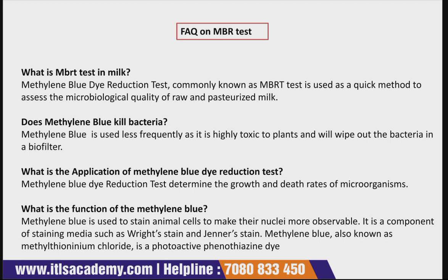Now the second question is, does methylene blue kill bacteria? Meaning, does methylene blue have the capacity to kill bacteria? Methylene blue is used less frequently as it is highly toxic to plants and will wipe out bacteria in a biofilter. Now the third question is, what is the application of the methylene blue dye reduction test? The methylene blue dye reduction test determines the growth and death rate of microorganisms.